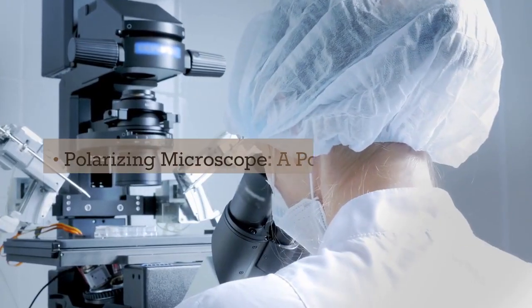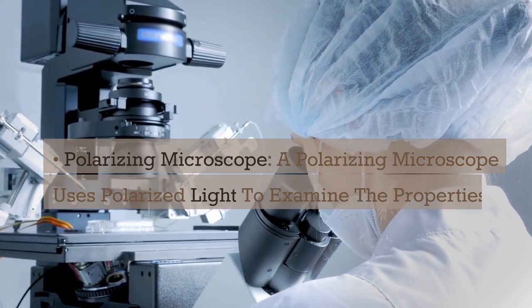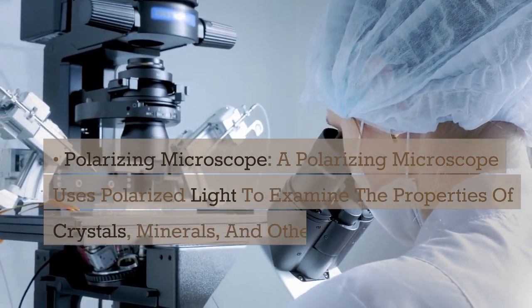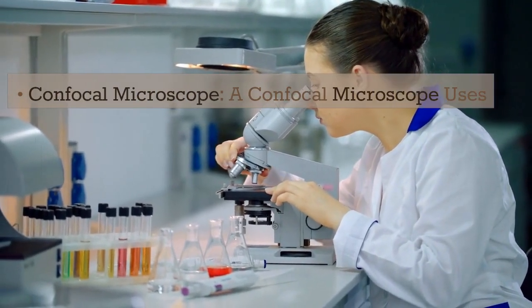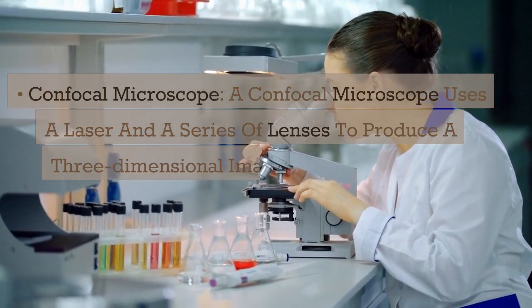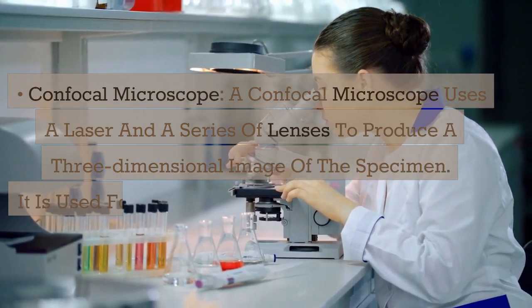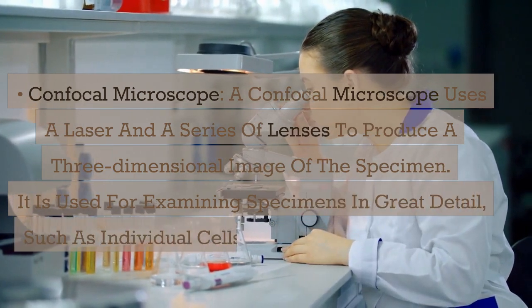Polarizing microscope. A polarizing microscope uses polarized light to examine the properties of crystals, minerals, and other materials. Confocal microscope. A confocal microscope uses a laser and a series of lenses to produce a 3-dimensional image of the specimen. It is used for examining specimens in great detail, such as individual cells or subcellular structures.